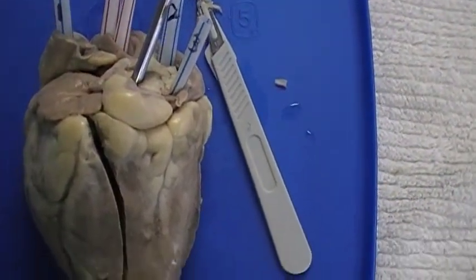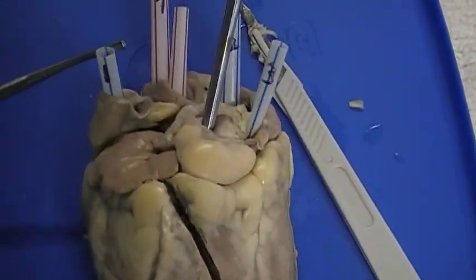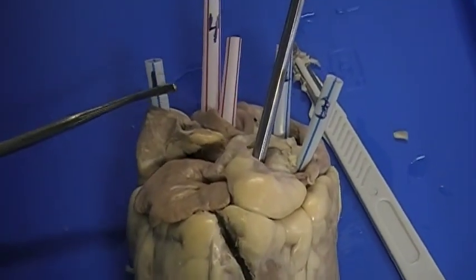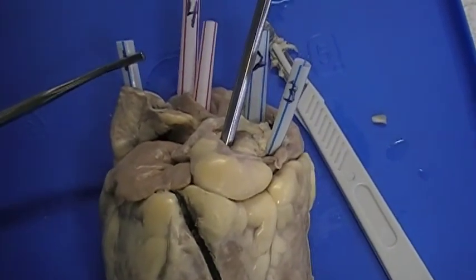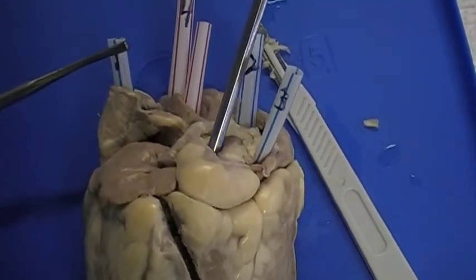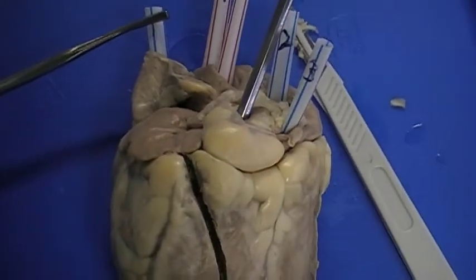But it includes the anterior interventricular artery, coronary artery, and I believe the cardiac artery. The pulmonary trunk, I actually labeled them, is the label 1 right here. And this is where the pulmonary trunk is, and the blood that travels here is deoxygenated. It is attached to the right ventricle and sends blood to the lungs.